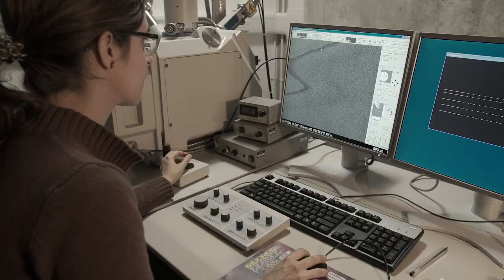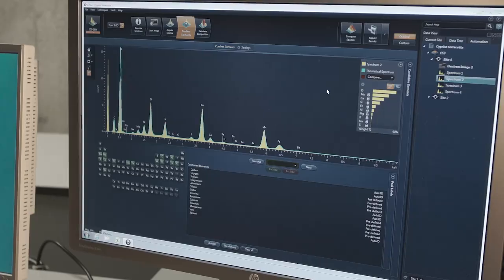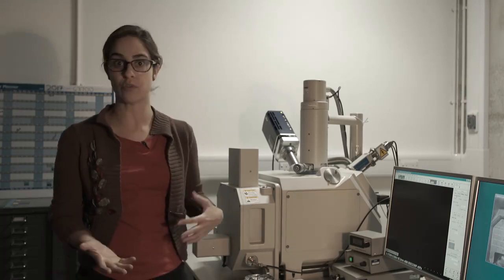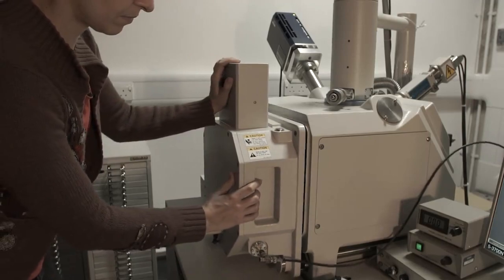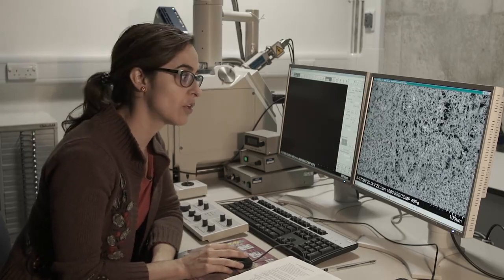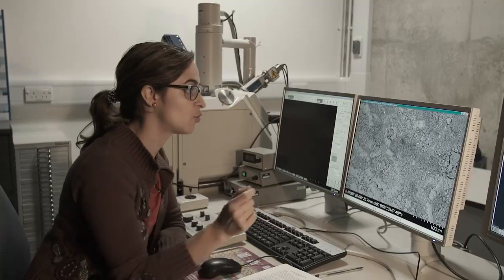At the moment we are in one of the science labs where we have the SEM-EDX — a special type of microscope that gives us a huge resolution so we can investigate the surface of objects and also do chemical analysis. Before irradiating objects with the laser, I investigate whether the original materials on the surface might be sensitive to the radiation. Here is an example: before irradiation you can see organisms covering the surface of the limestone; after laser irradiation, the treatment has destroyed the body of the biological colonizers that were growing there, and after swabbing with a mild solvent the clean limestone surface is revealed.